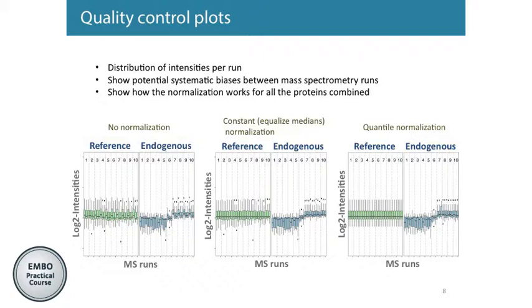For example, this is relatively really good quality data. But sometimes a specific run, a specific box, is really up or really down. In this case, you need to double check what actually happened. This specific run is relatively really low compared to the others. So this is a really critical point to check.